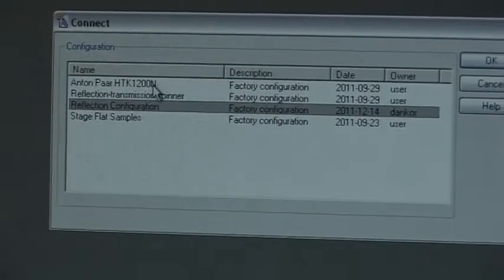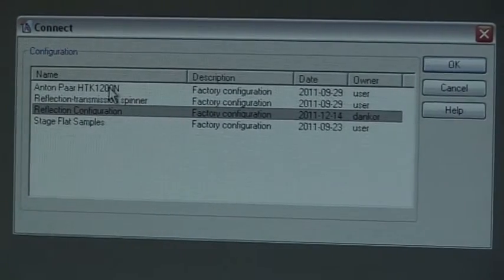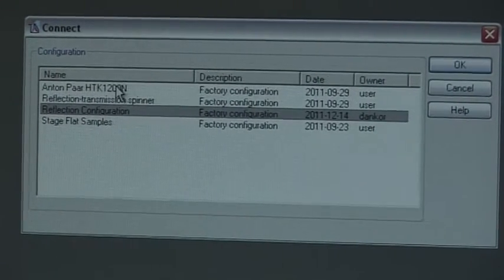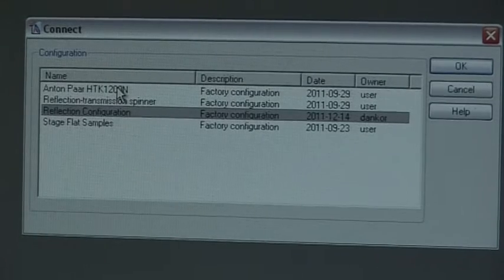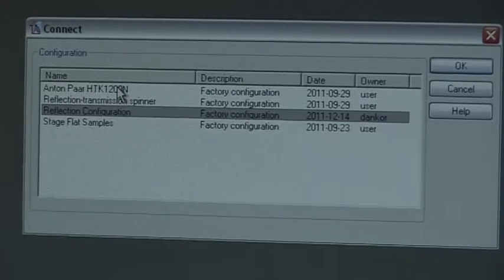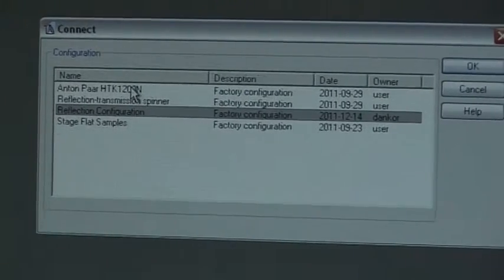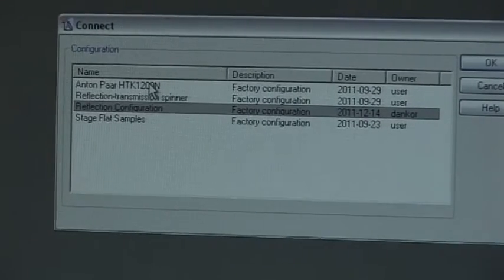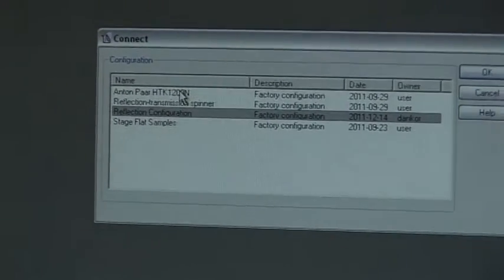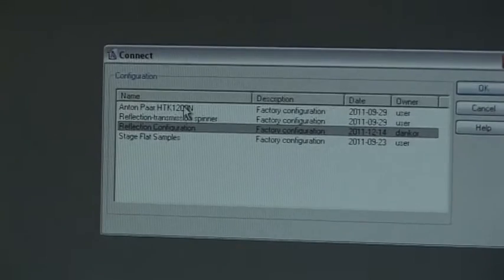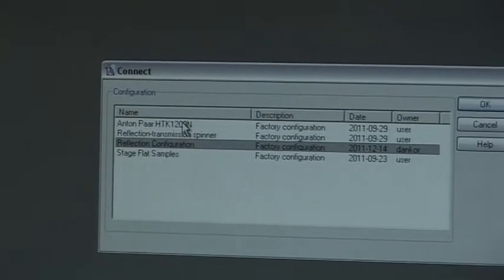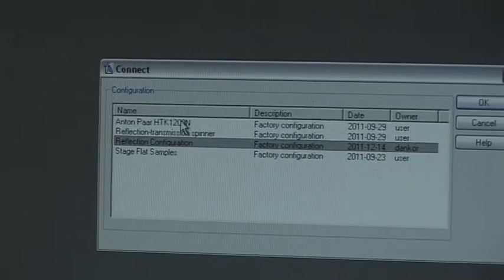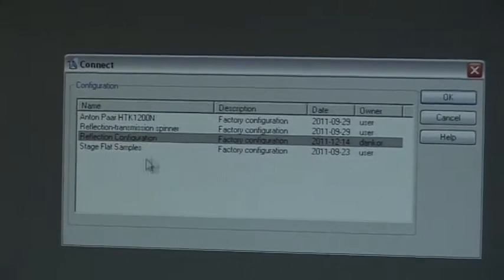We can also use a furnace as a sample stage. If you want to study X-ray at a different temperature, sometimes it's very important to get the knowledge about expansion or changing of the unit cell. You can put it inside the furnace and then start heating it, and then the machine will take the data every now and then. But for now we use the standard reflection configuration sample stage.